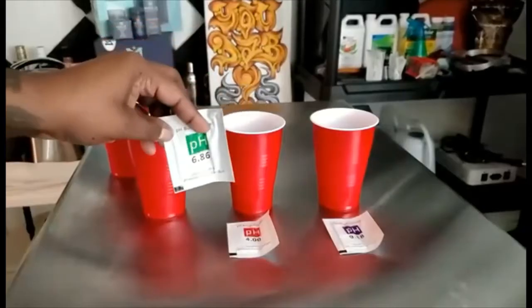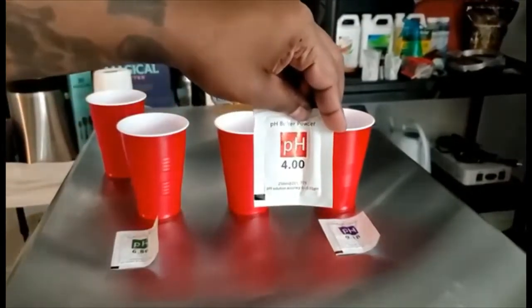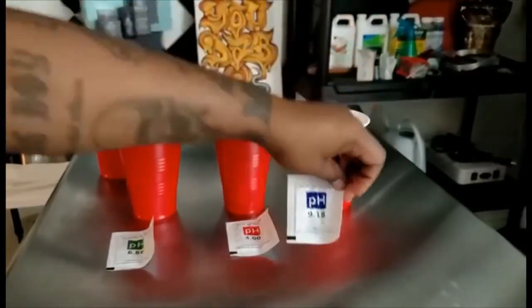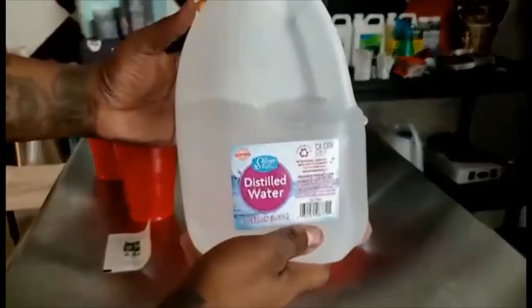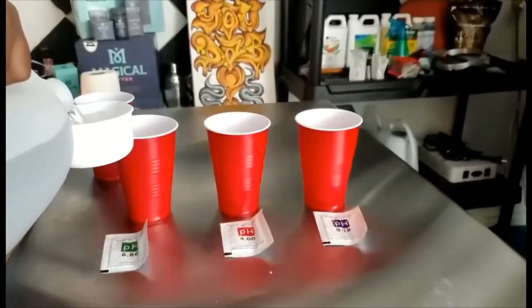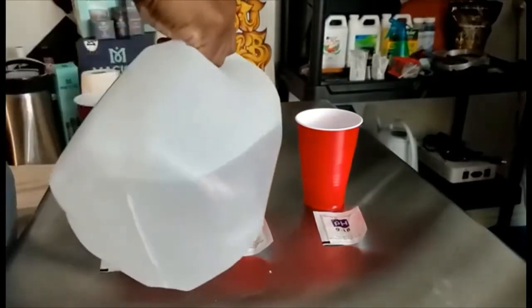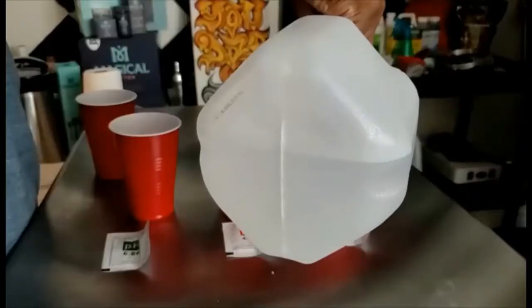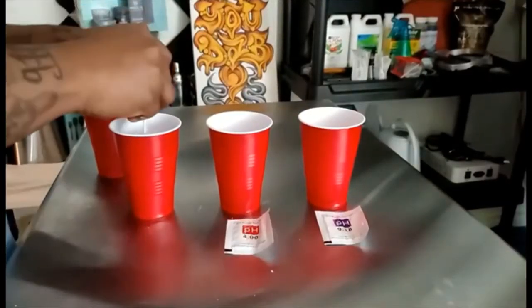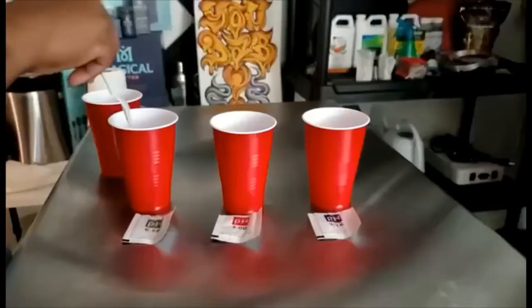The first thing we have to do is make our three calibration solutions — 6.86, 4.00, and 9.18. The cup in the back is distilled water. We're going to take 250 milliliters of distilled water, put it into each cup, then pour the pH solutions inside and stir it up. Make sure you stir it until it's dissolved.